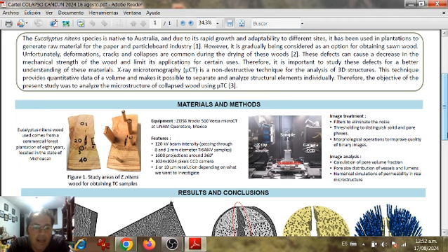For this analysis, we produced different sizes of samples in order to obtain different voxel resolutions to analyze the macro and micro structure of the deformation found after the collapse. After the preparation, we obtained samples of different diameters, 1 or 10 millimeters diameter, in order to obtain 1 or 10 micron resolution.